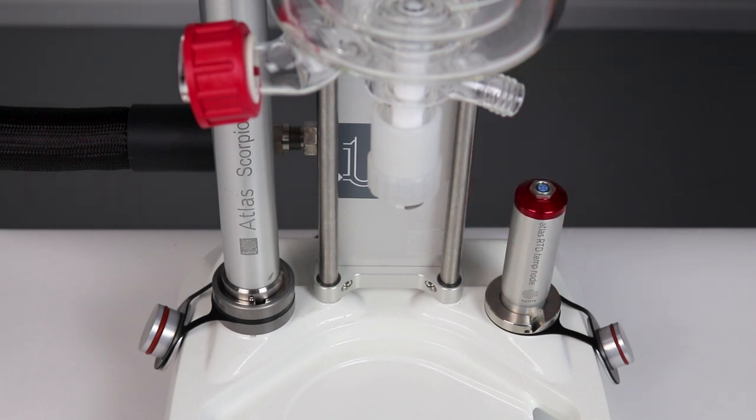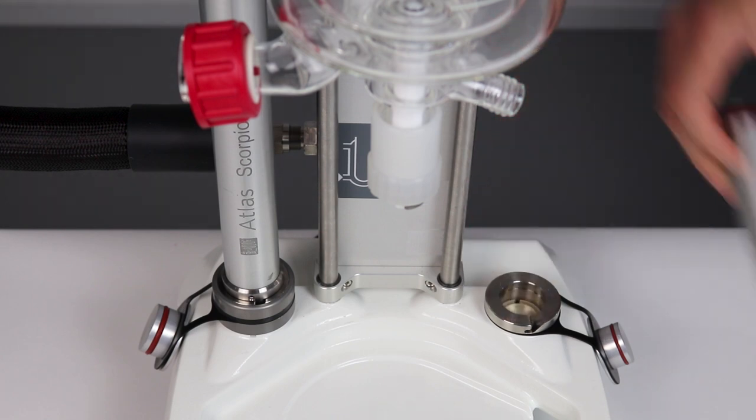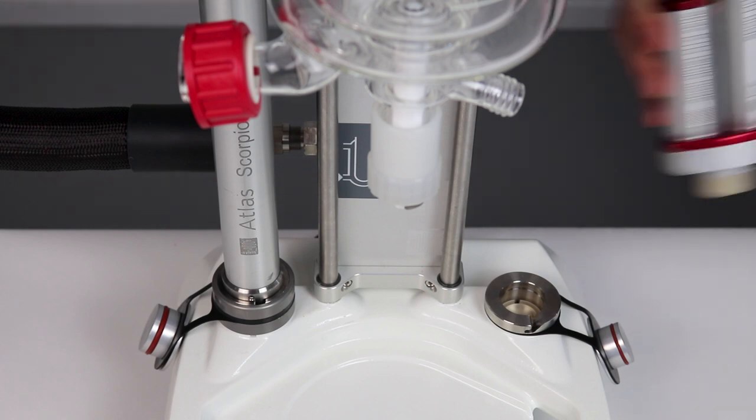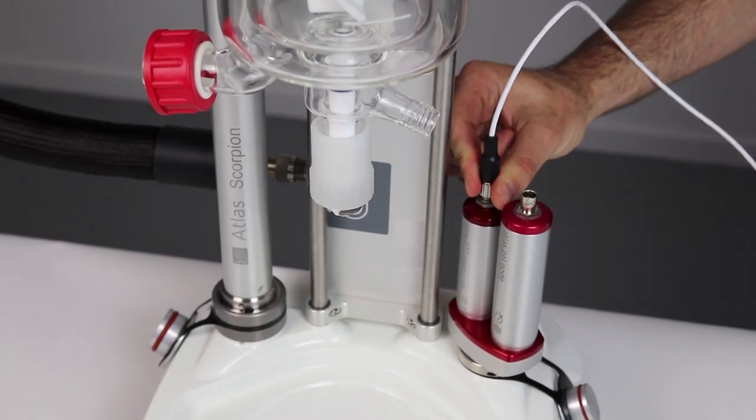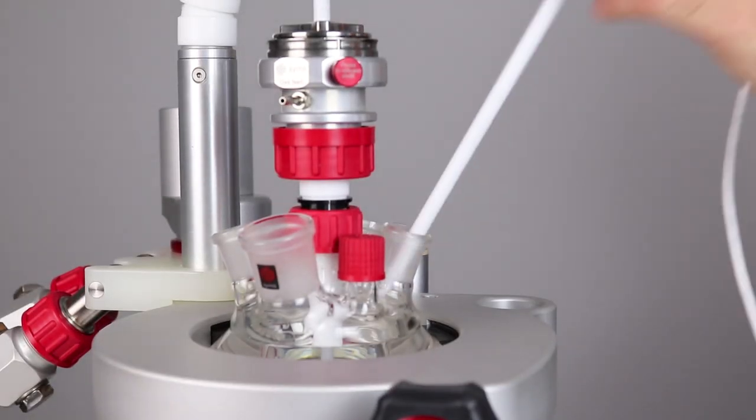And finally pH, turbidity, temperature and pressure can be measured using nodes that click directly into the base unit with up to six sensors being able to be measured and recorded simultaneously.